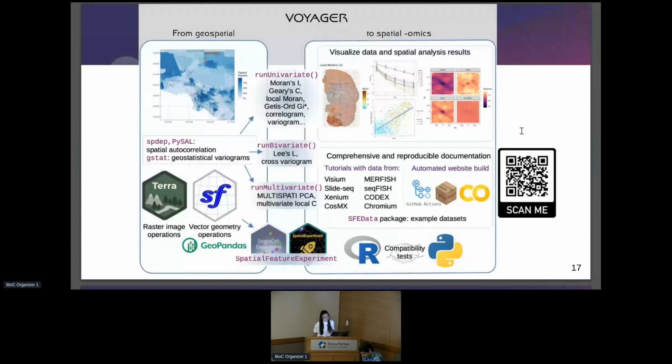And because GitHub Actions has very limited computational resources, I have to make sure that the methods are at least somewhat scalable. And actually, I did build the vignettes on GitHub Actions with a MERFISH dataset with around 400,000 cells, and it works. GitHub Actions also automatically generates Google Colab notebooks, which are linked on the website, so you can change the parameters and explore more on the vignettes.